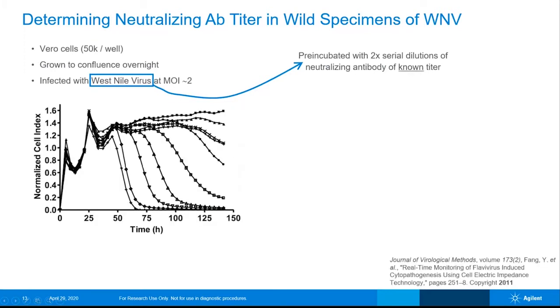This is the data. Again, the notion of a fingerprint. So these Vero cells behave very differently than the A549 cells I showed you a few slides back. Vero cells, as you probably know, are kidney cells from African green monkey. They have a fibroblast-like phenotype. And this is a very common type of impedance trace for fibroblasts, where they show a very rapid increase in impedance and then a relaxation followed by another rise. But this, over the first 24 hours, is what the cells are doing by themselves.